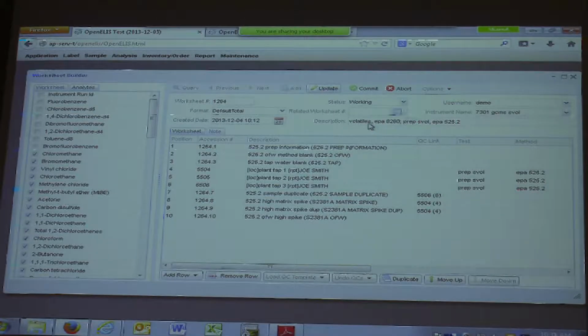No. If I commit, since the description's already there, once the description's there, you have to actually manually change it. It doesn't do anything automatic anymore. Okay, so that's a matter of housekeeping. I'll go ahead and take that off.